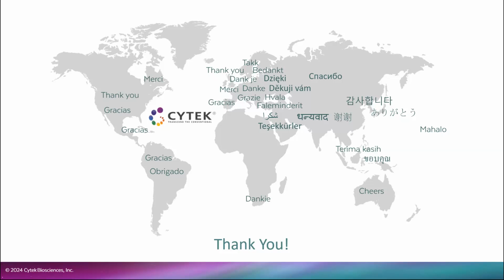Another thing that you could do is decide that you don't want raw data anymore, you only need the conventional data. The way in which the experiments are named will also have an indication, comp, at the end. So there are multiple ways you will realize the particular mode was used, as well as in the file properties whenever you have a file displayed on SpectroFlow.